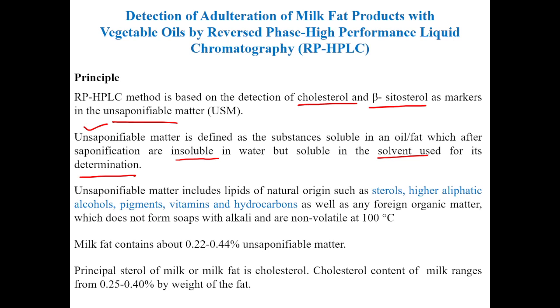The soap is soluble in water, but the unsaponifiable matter is not soluble in water, and is soluble in the solvent used for its determination. Then what does USM include? USM includes lipids of natural origin. These are not saponifiable, as already told.